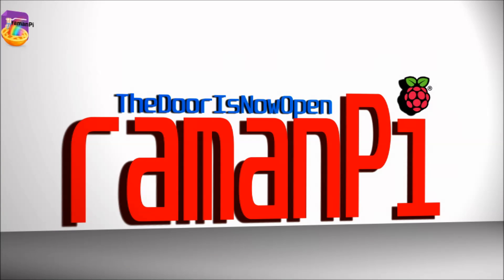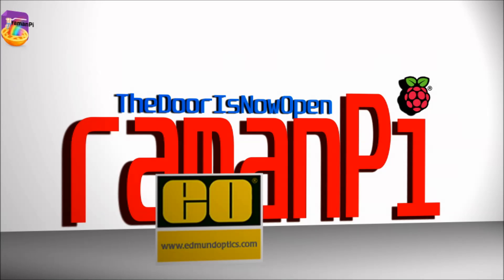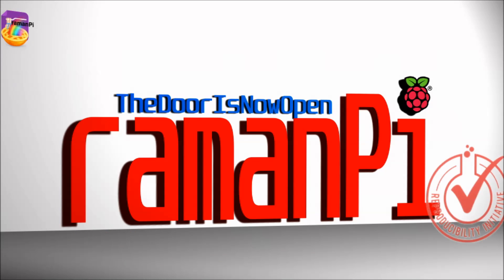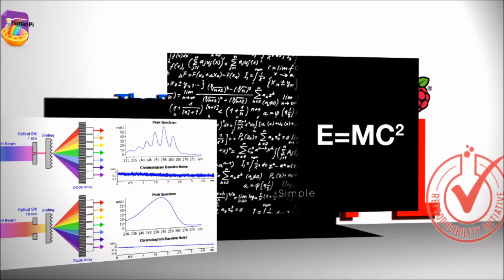The design can be reproduced very easily. For high volume production, you could use injection molding to make the 3D parts, and 3D printing for lower quantities would be a totally acceptable option. The optics are right off the shelf and can be purchased individually or in bulk from companies like Edmund Optics. The electronics are very easy to source and will be integrated down to two boards for the whole system very soon. The CCD is inexpensive and is the same version commercial systems use. I kept the design as simple as possible while maintaining the integrity of a Raman spectrometer with a respectable spectral resolution.